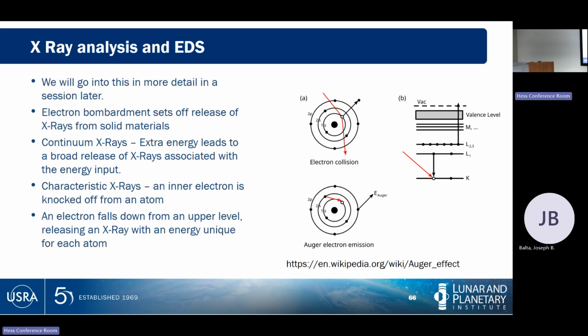And every time that shift happens in that atom, it will release an X-ray with that exact same energy. Because the electron cloud will respond to the charge of the nucleus and the rest of the cloud around it, this X-ray has a characteristic energy for each atom. We call them characteristic X-rays.